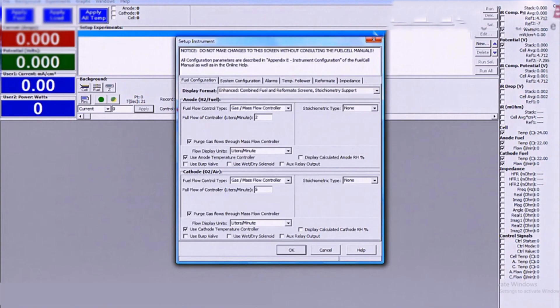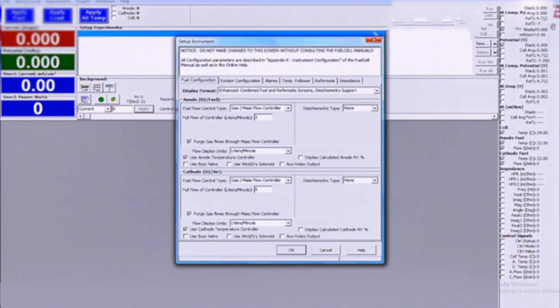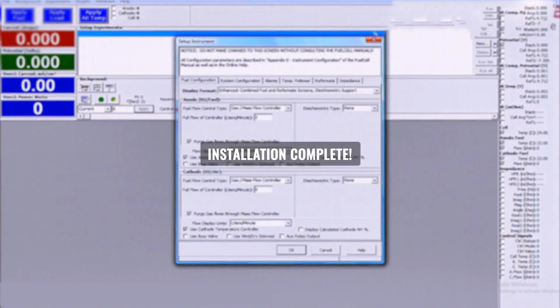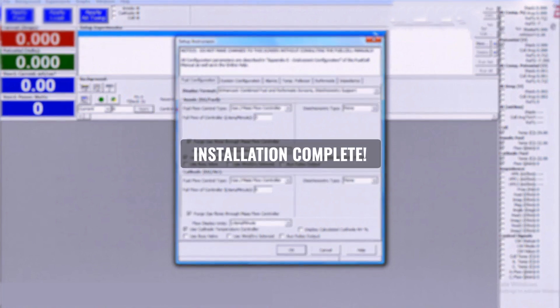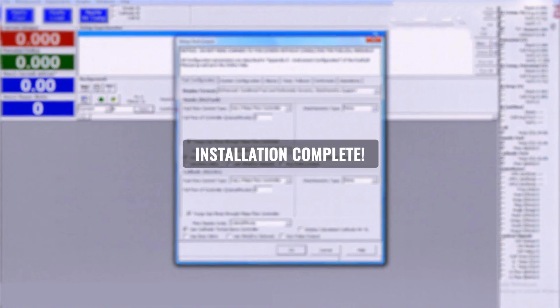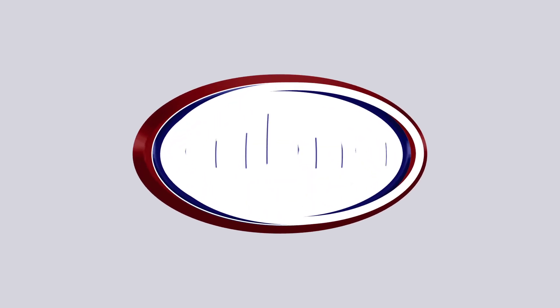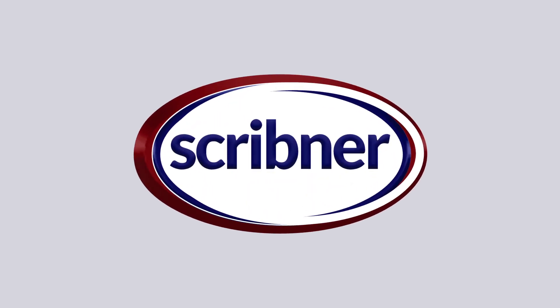The instrument configuration screen is used to configure the software to match the test system specifications. Mass flow controller sizes, humidifier bypass, auto multigas or AMG, alarm responses and other items can be configured here. The 850 is now ready to be used.